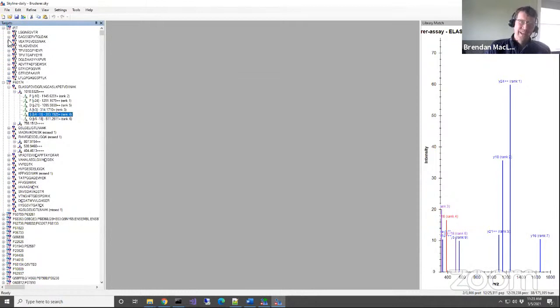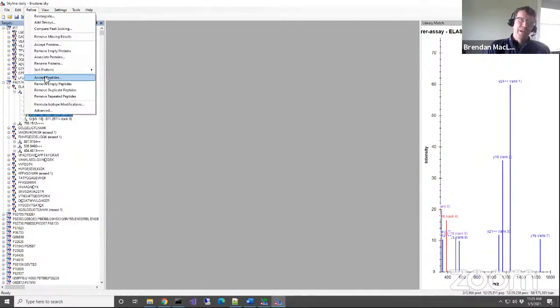But it will keep your standards. So even if you didn't say iRT is something you want to keep, it should keep your standards. So pretty early, because we were doing these refinement experiments, we were like, oh, I did all this statistics and I figured out a set of things that you want. And if you were here on Monday, Lindsay took you through getting FASTA for exactly the proteins you want and only inserting that into Skyline.